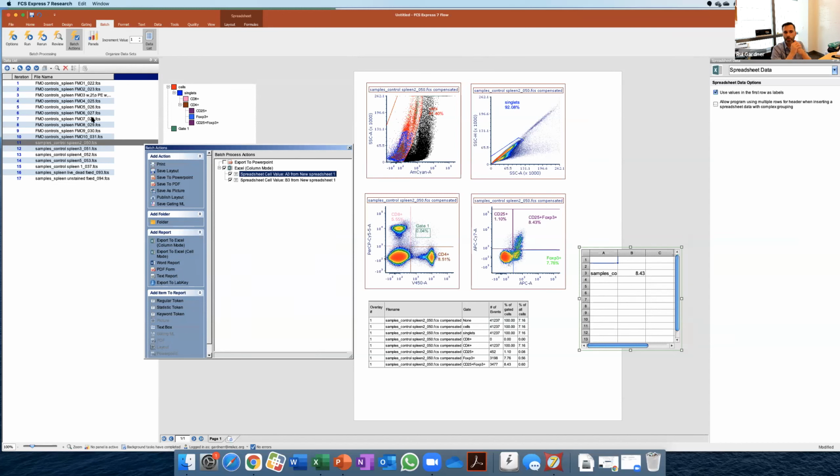So it's basically, like I said, FlowJo also does all these things in a different way, but there should always be a way of doing this very automatically. Imagine you have hundreds of samples or even 100 samples. You're not going to write down the statistics by hand. You can just do this and you would export. It doesn't matter if you have 2 or 200 samples.